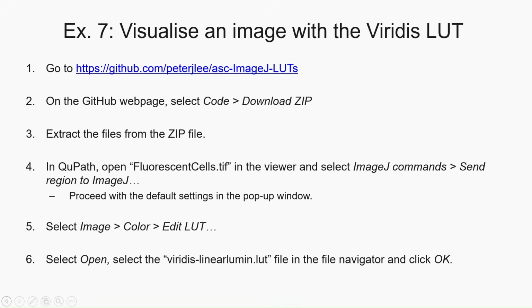Once applied, compare the appearance of the image to the default visualization. Pay attention to how the same underlying data may become easier to interpret depending on the LUT that you've chosen. Remember that applying an LUT changes the visual representation, not the measured fluorescence intensity values themselves.